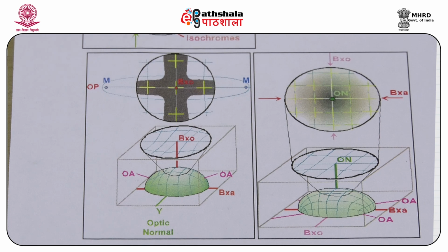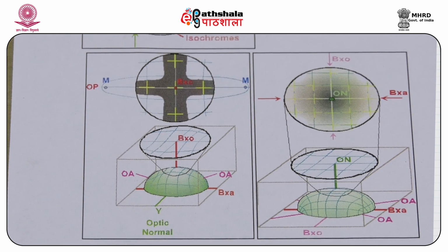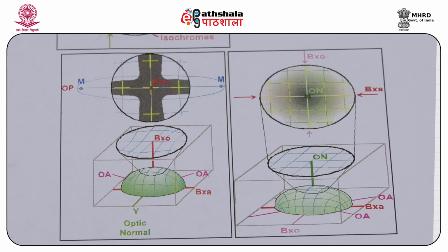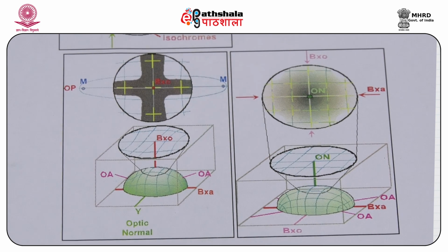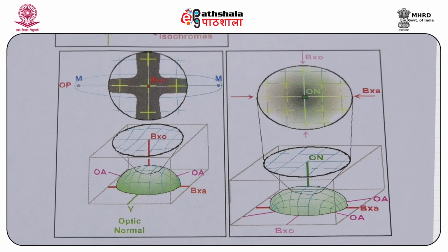When the X and Z axes, the optical directions, are parallel to the vibration directions of the polars, the figure, as you can see here, is a poorly defined cross. On slight rotation of the microscope stage, the isogyre splits into two hyperbolas, moving rapidly out of the field of view in the quadrants containing the acute bisectrix.